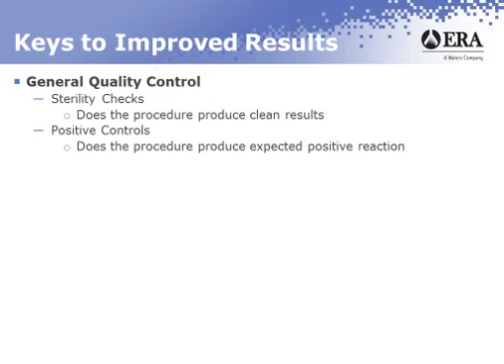You should always be challenging media and new equipment to make sure that you don't have an issue. The cultures could be like a single-use preparation, or again, cultures that you maintain. You just want to make sure that you have a good purity and good viability of the organism.